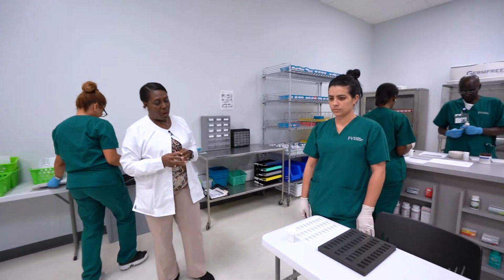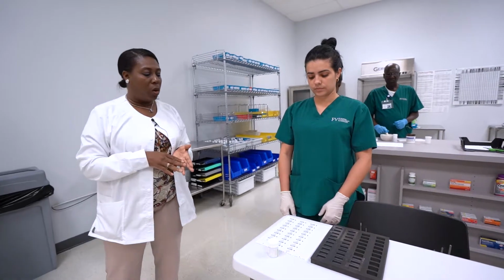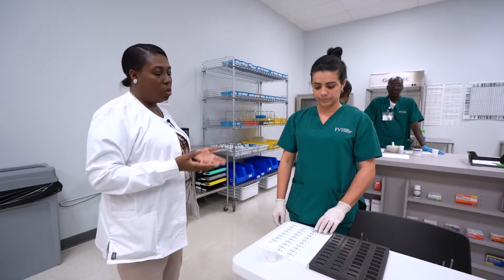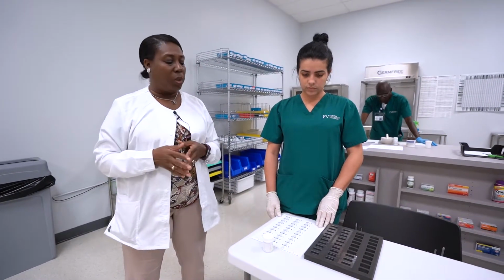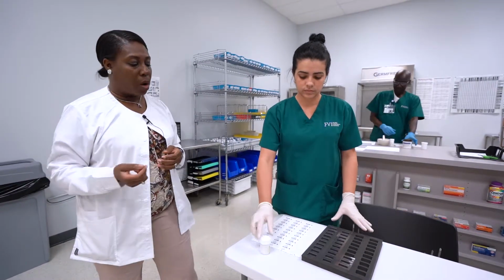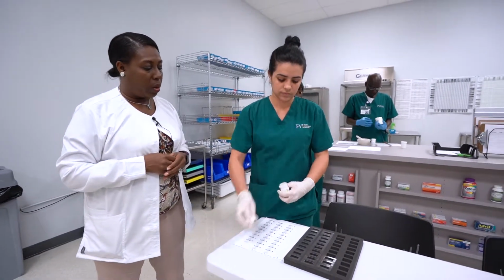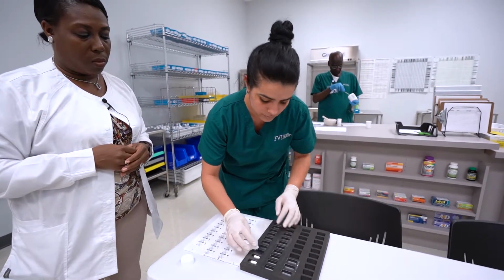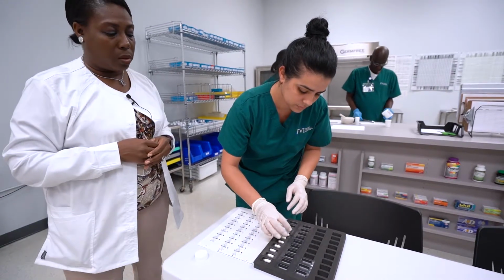So next we have Ms. Dorellis. Now, this is also a process that can take place in long-term care, but it also can take place in a hospital. It is called unit dosing. So in unit dosing, we have pre-printed labels that we get from the computer, and we have selected our medication. Now, just like the bingo cards, we will put the medications in the slot that is available here. And again, we want to make sure that we have one medication in each slot.